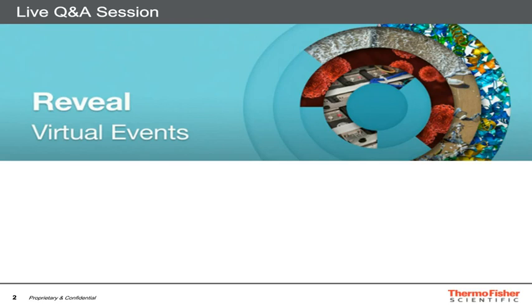Great. Thank you. Another question: is it possible for XPS to reveal the chemical structure of MOFs, such as oxidation state and electronic structure? Hi, this is Paul, and thank you for the question. Yes, it is. We looked at a copper metal organic framework sample recently, and we were able to work out that it was a copper 2+ oxidation state.